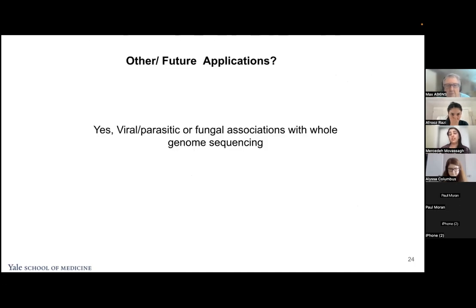So I just showed you 16S data, but you can have the same logic when you're doing RNA-seq pathogen detections, so you'll have viral, parasitic, or fungal data, and you can do this sort of analysis with it. So I know I said a lot.